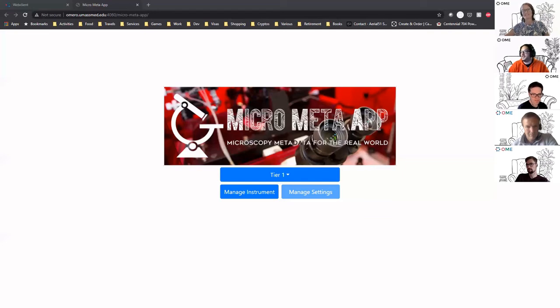Again, in a perfect world, the best solution would be that every component is recorded in a database. Once you record one component with our app, or whichever app allows you to write a JSON file following a standard, that component should be saved in a database. Then the database could be accessed directly from the app: okay, I'm adding a light source, this manufacturer, this model, and the standard is already written, so here is your light source, and the database serves your light source. At this point we are still in an early phase, so the database still needs to be made and filled.